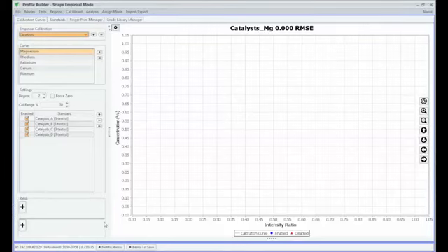We use intensity ratios in LIBS because it's very helpful to ratio the element you want to measure to some sort of reference element. In most cases, you're referencing or ratioing to an element that is the base material or represents the balance of the elements or the bulk of the material.